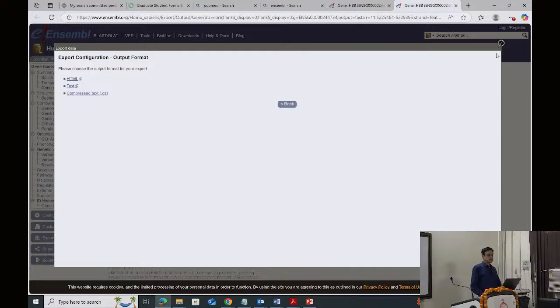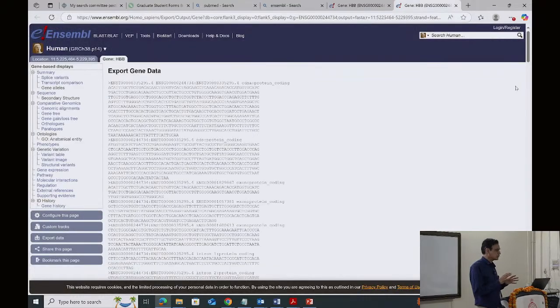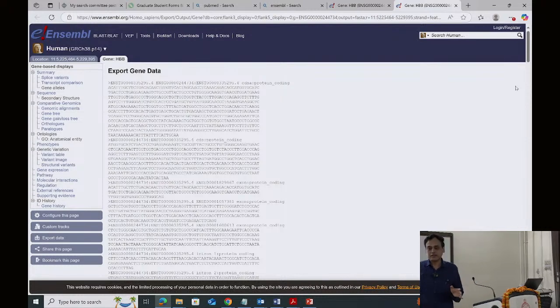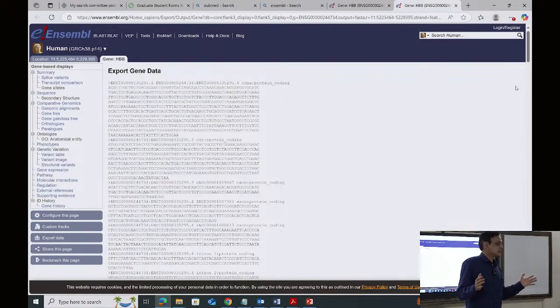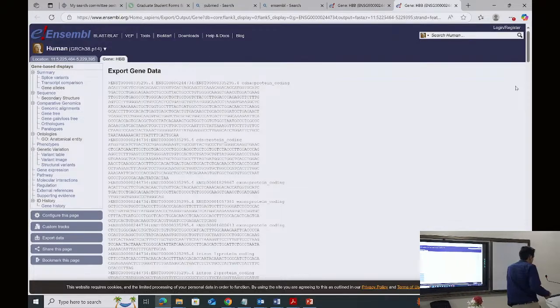About the variants of our interest: when you have to analyze without focusing on any particular variant, select the first one, of course, because that is the reference sequence. You would want to use the reference sequence, but if you are interested in a particular variant, I think there are 6 variants or so in this, then focus on that variant.